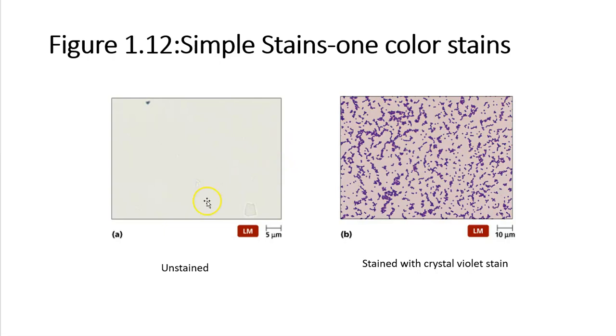And as I said, here it is unstained, same thing. You put it in a stain, you can see it. I can see the size and I can see the shape. That's all I can give you at this point in time. Okay. And what we do in general labs is stain them with different colors so that you can see the difference. There are several different stains we use in the micro lab. So you can stain with blue, you can stain with green, you can stain with purple. We've got all kinds of fuchsia that you can stain these guys with.